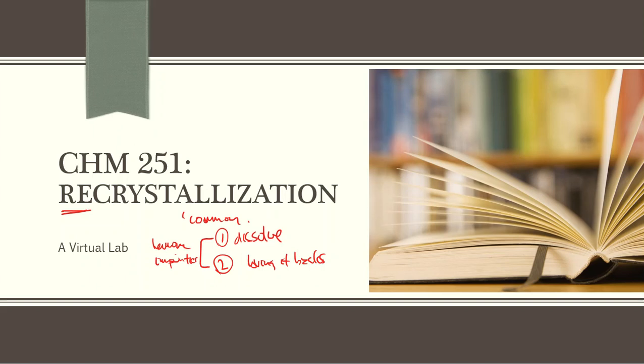All right, so think of Walter White on Breaking Bad. Walter White was known for his recrystallization techniques. That's how his product was basically generally regarded and widely known and widely sought after. So you are going to be maybe not Walter White, I hope, in this virtual lab, but you will make Walter White very proud if you end up with a very clean, pure crystal in the very end of this process.